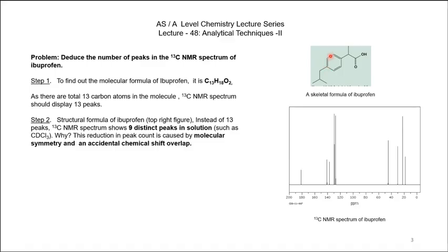If we look at this, instead of 13 peaks we get 9 peaks, and these distinct peaks are of different carbon environments.